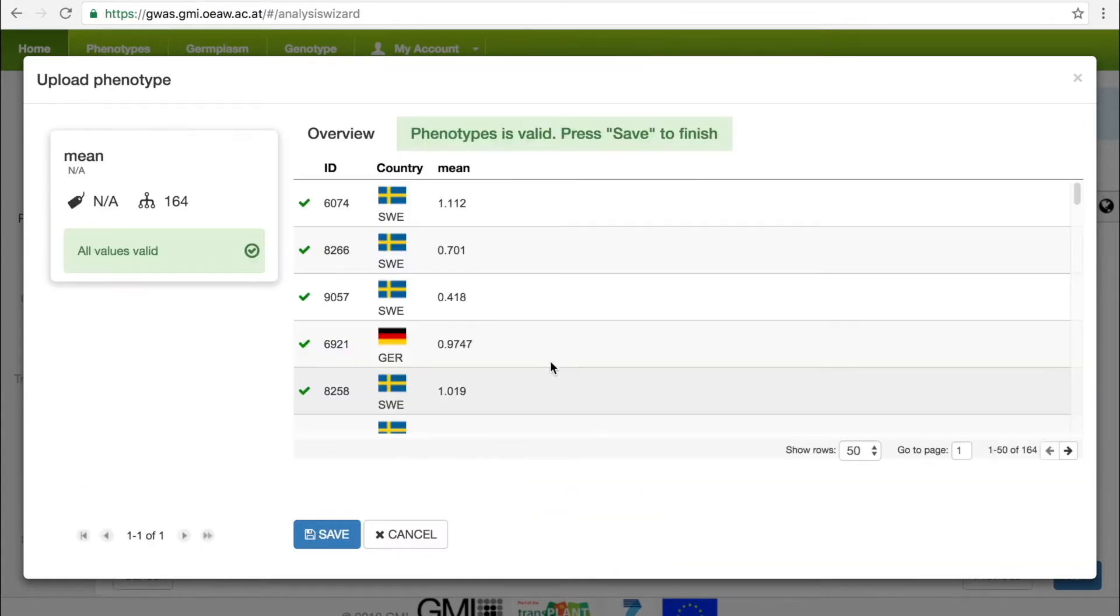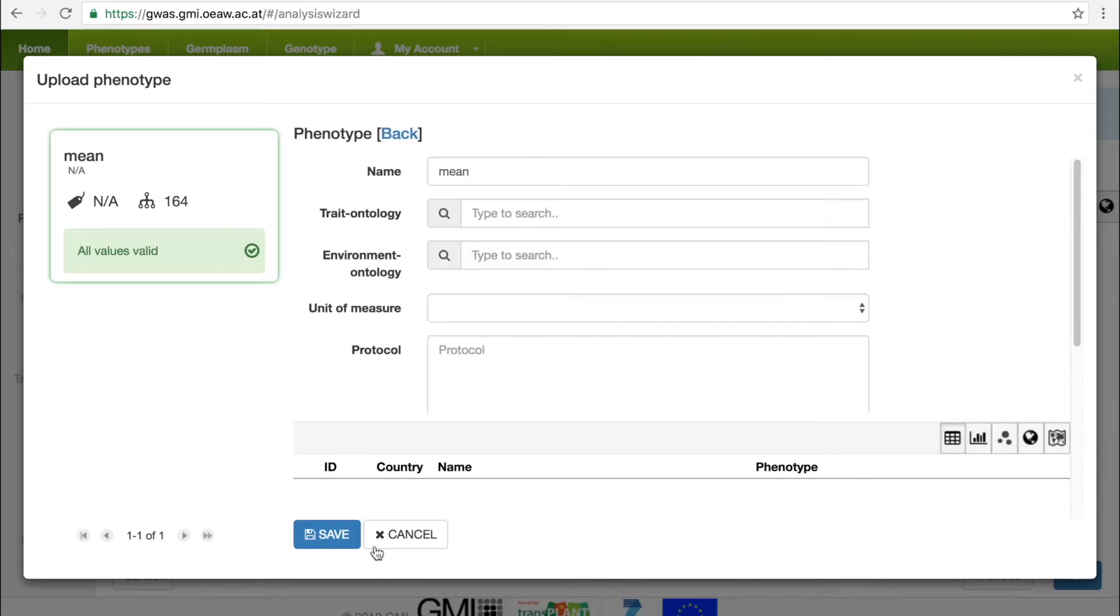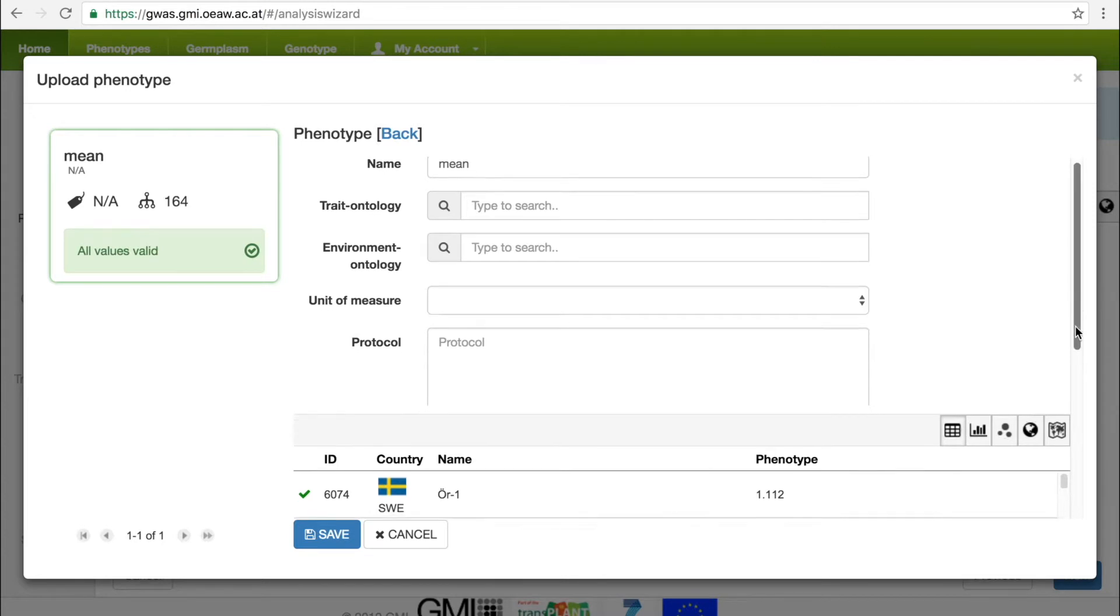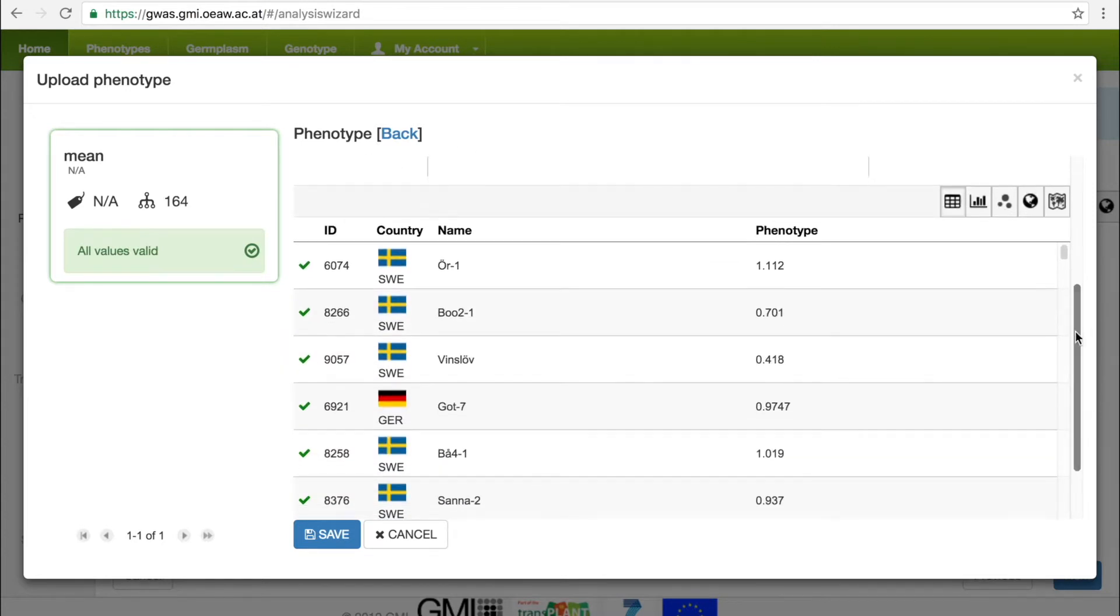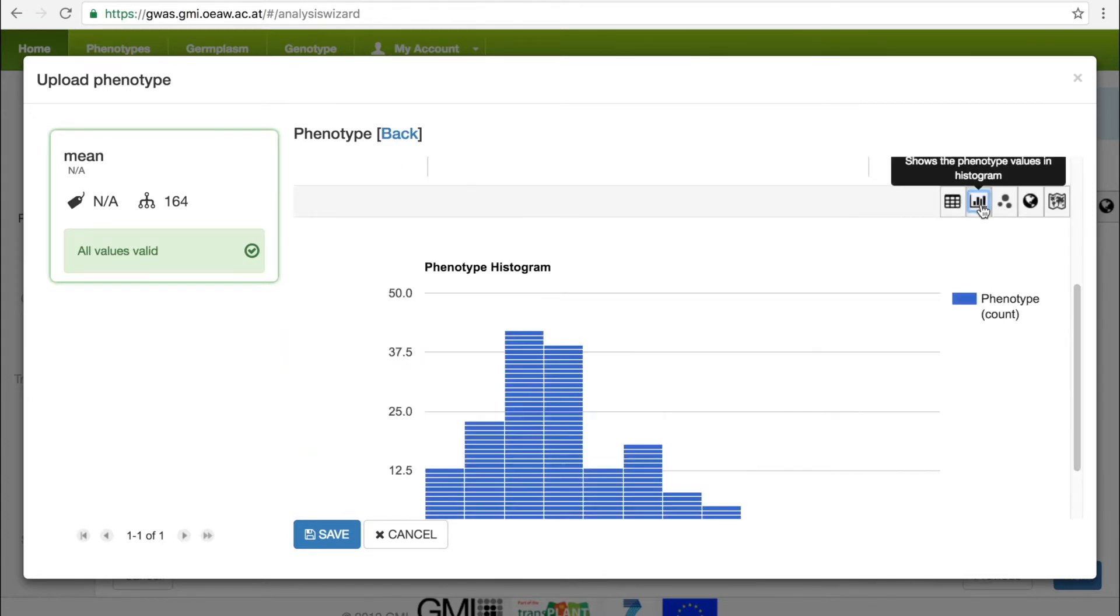Once the file is uploaded, the GWAS Portal enriches the uploaded phenotypes with additional meta-information about the accessions, which can be displayed in different ways. For example, phenotype values and country of origin in a simple table. We can also visualize the data as a histogram.